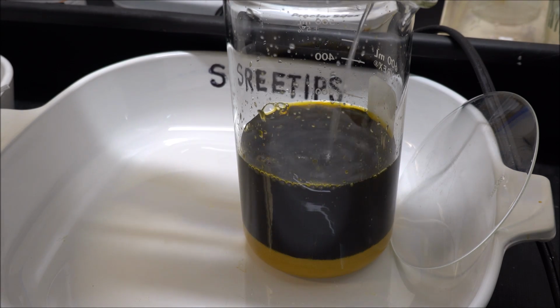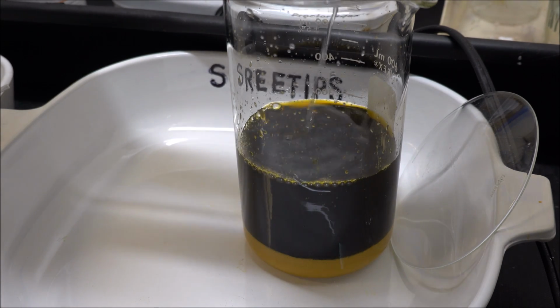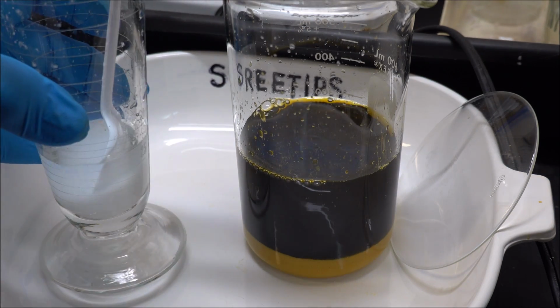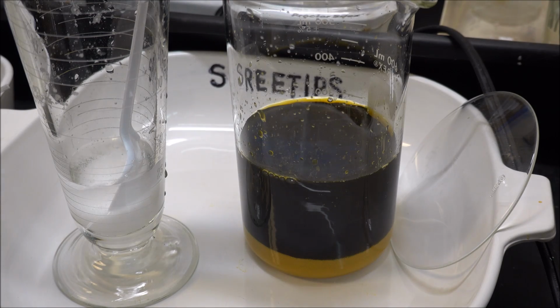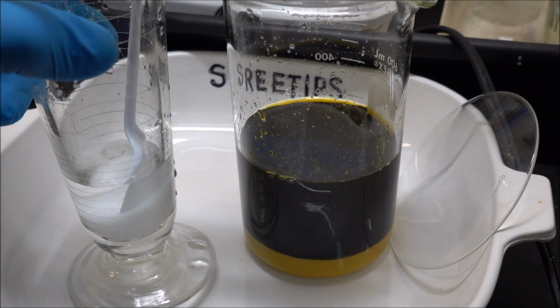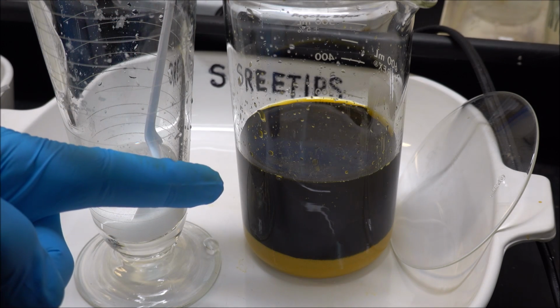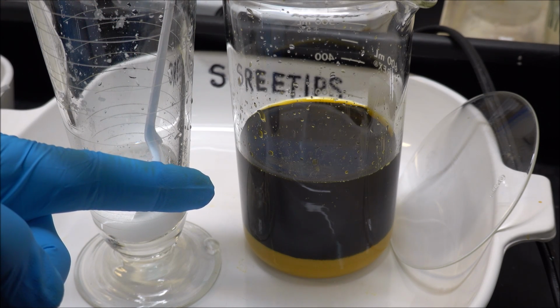And I don't see a lot of that coming out of solution, so we must have got everything dropped. I didn't see any more platinum coming out of solution there, but that's okay. I need excess ammonium chloride in this solution for the next step to get the palladium out.